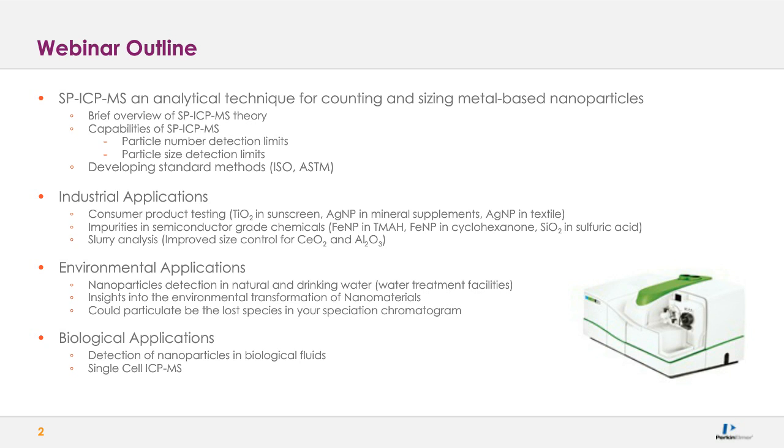And then I'm going to be transitioning to the biological applications. On that, I'm going to be talking a little bit about how we can look for nanoparticles or nanomaterials in biological fluid, and I invite you to attend our single cell ICP-MS webinar that will be following next month.